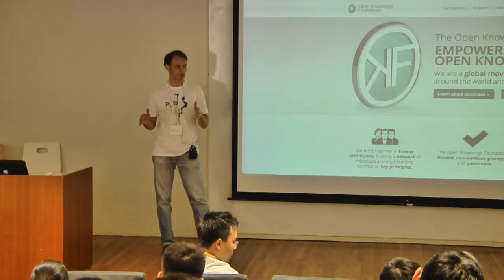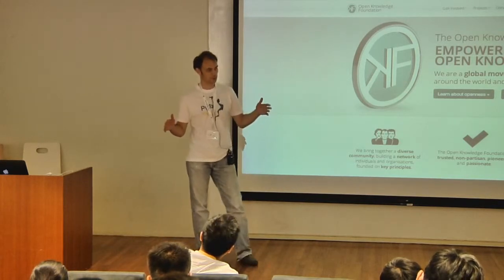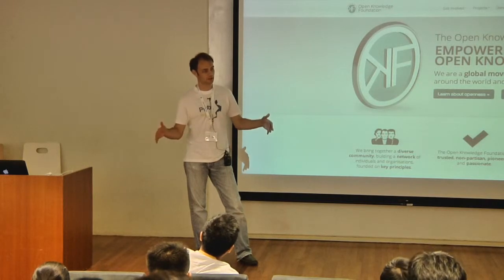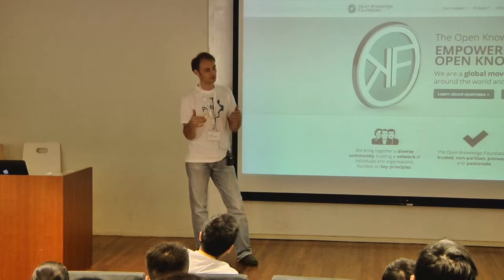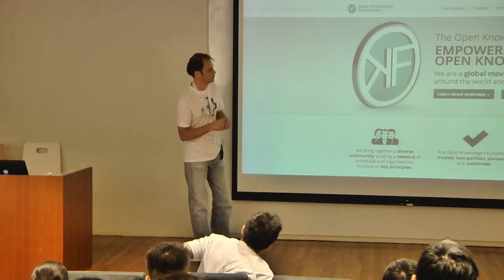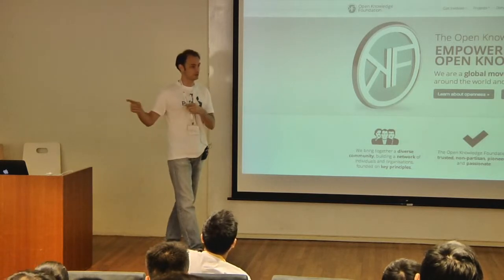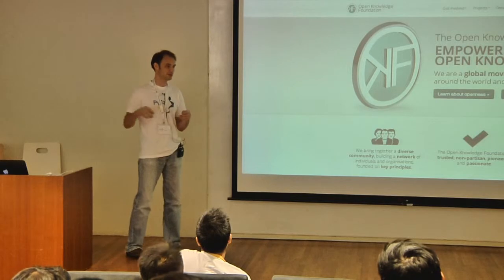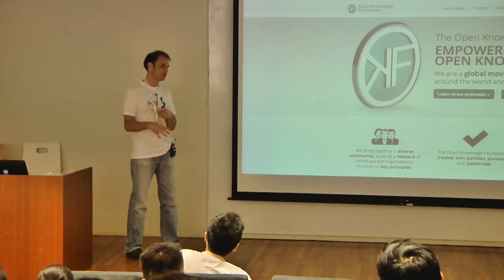The only thing I want to do is this: many files which come out of equipment have this header, which is binary, which is embedded into my file, or it is saved as a header file next to the data file. And this is binary, and this is not searchable. So when I do an import of a project, I have a hook that knows how to parse the binary header and dump it into JSON.